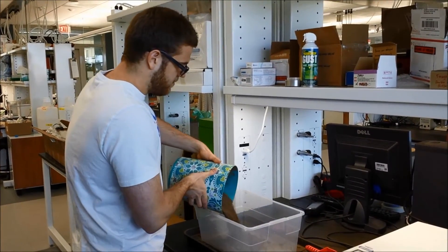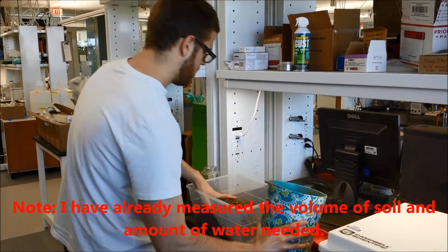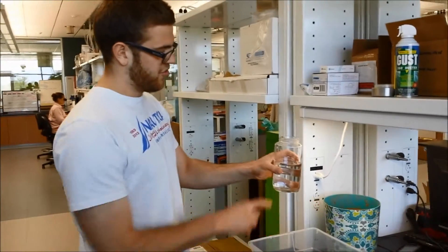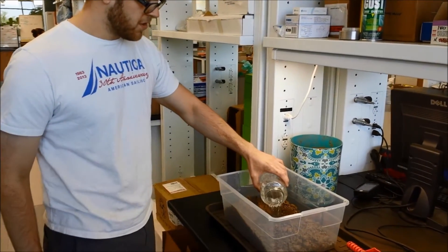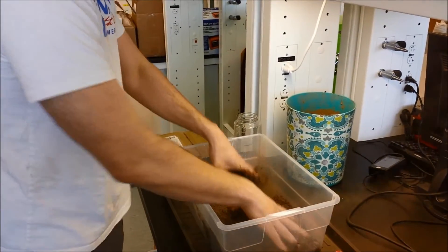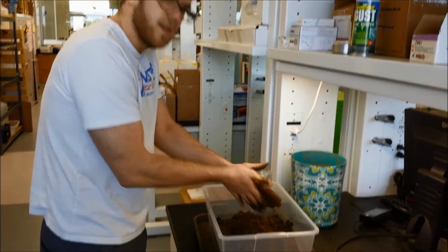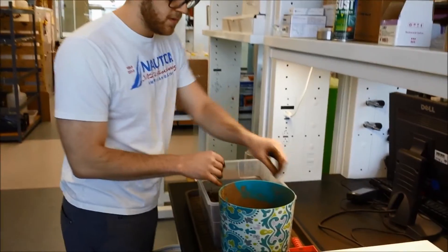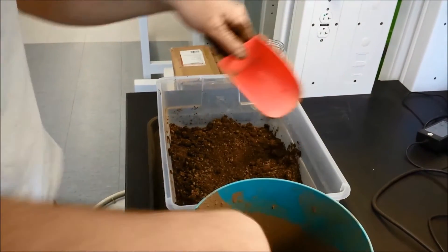The next step is to wet the soil. Place the soil into a mixing container. Add a half milliliter of water for every 10 milliliters of soil volume. Once the water is added, the soil must be mixed until it is homogenous. Once the soil has been thoroughly mixed, it can be put back into the calibration container at field density.